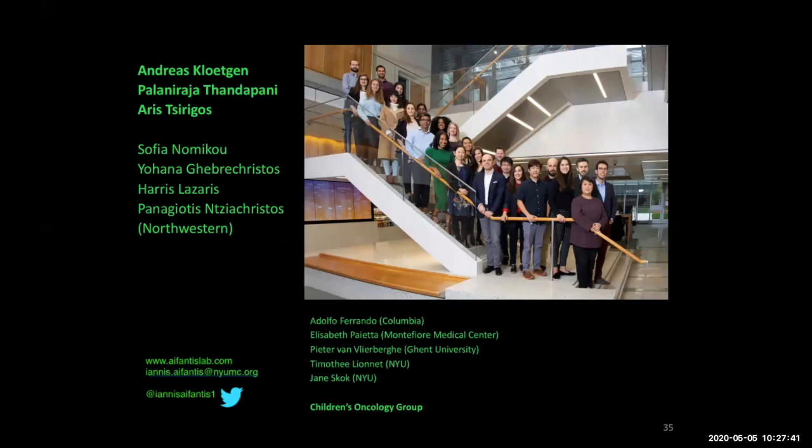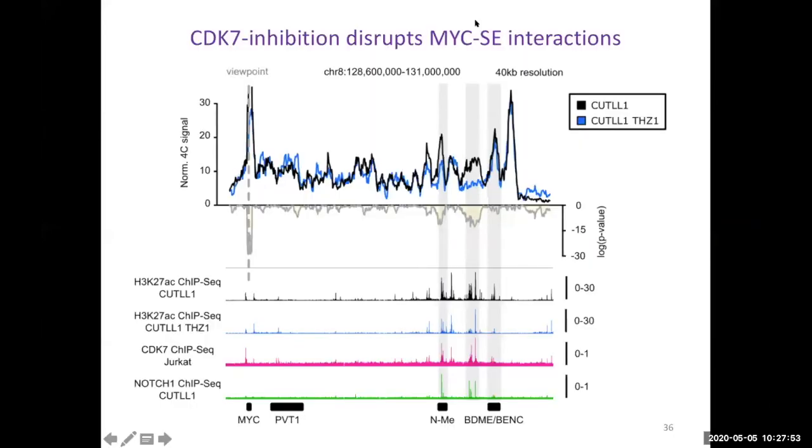Okay. All right. Let me just do one last scan here. I think that's actually Andreas wrote in. Let me just read it out loud. So the TAD activity metric is the sum of the interactions within the TAD area. It was initially a mere technical reason when we had sequencing depth as low as 150 million total reads.